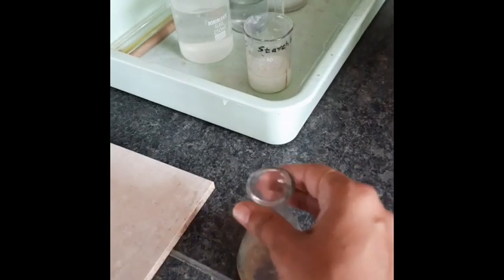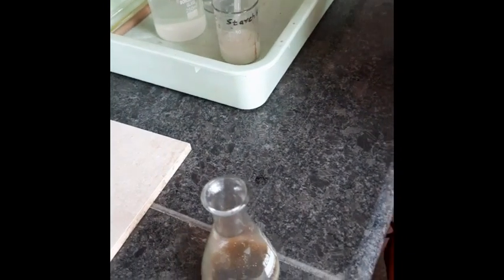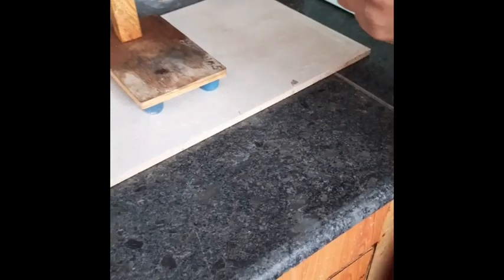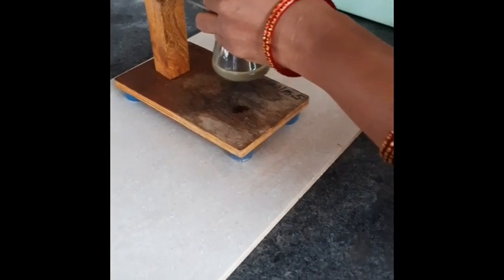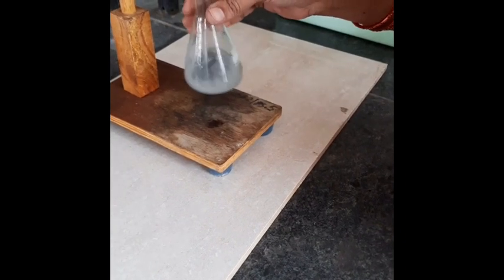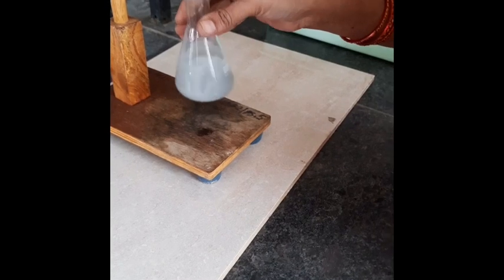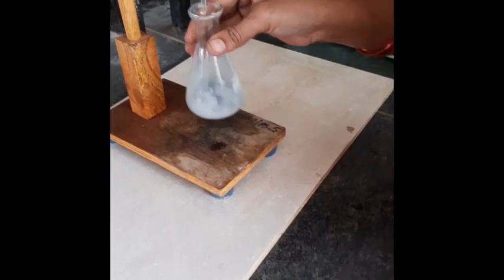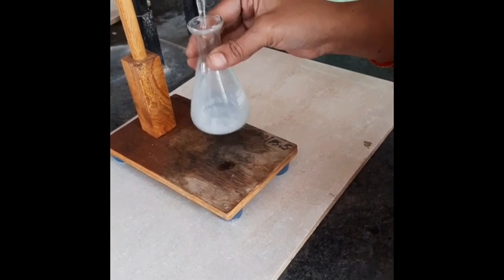See, yes, you can see the iodine is liberated, blue color is obtained. Now titrate this till that blue color disappears. Okay, blue color will disappear and the solution will turn milky white.